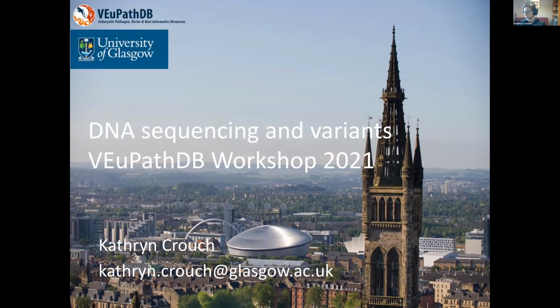Okay, so when we were putting this together, we were going to do another exercise in Galaxy, and unfortunately we don't have time for that, but we decided to just run quickly through the slides for that anyway, because it talks about how we process the data for whole genome DNA sequencing and variant calling, and it helps to understand what's happening when you run the searches. So we're going to run through this quickly.